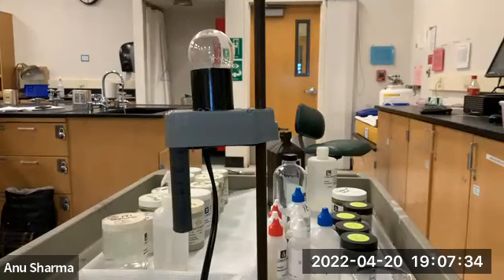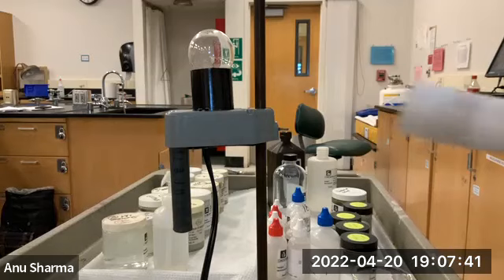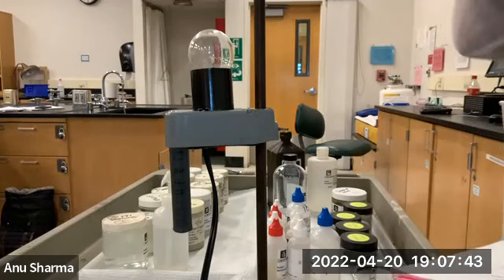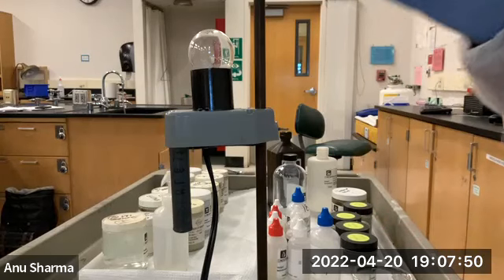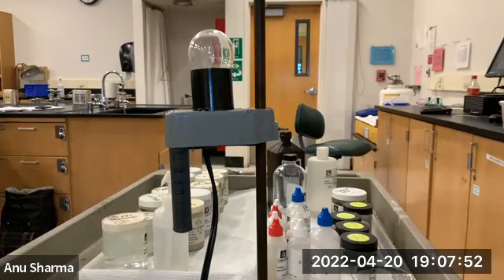Okay, so now we are recording the demonstration of this lab, experiment 11, conductivity of solution. So we already discussed the conductivity classified as electrolytes, non-electrolytes, and the weak electrolytes. So we will look at the different solutions here, and we'll see what category they fall in. So you're going to look into the major species, and really the minor species, ions.